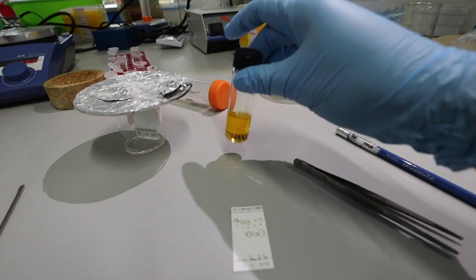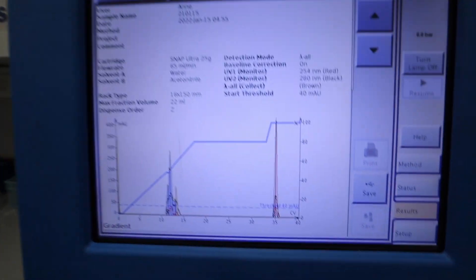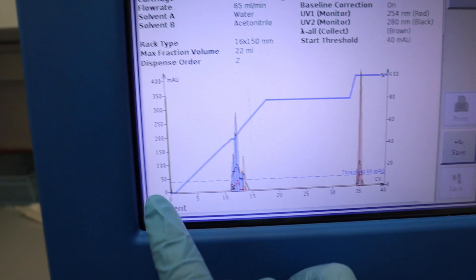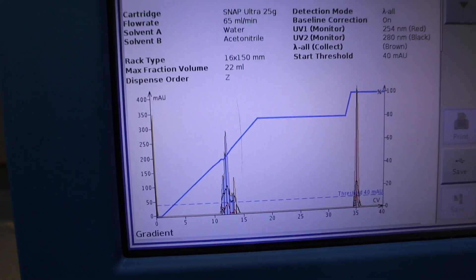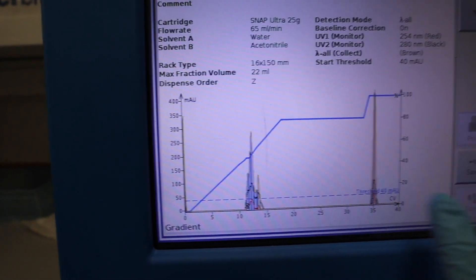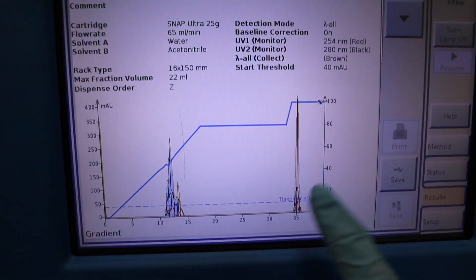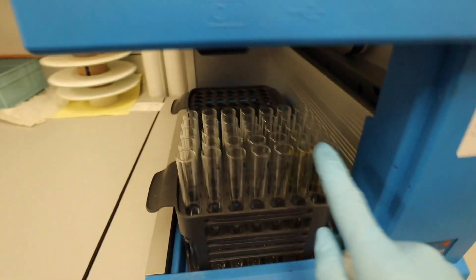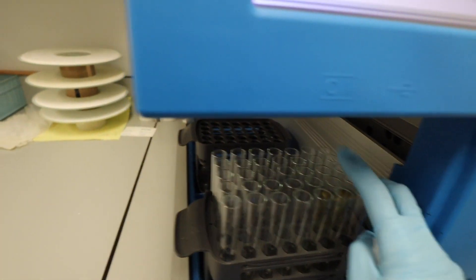So this compound now is ready to be evaporated to remove the solvent and this is my final report. So I need to dump all the solvent. So yeah, we saw three spots on the TLC. So I think this is first, second, third. This should be my product, this should be the unreacted drug. There's only two fractions, so it's not too bad. So I don't think I'm going to collect this because yeah, I can't be bothered.